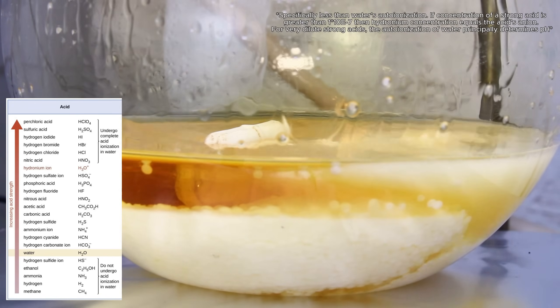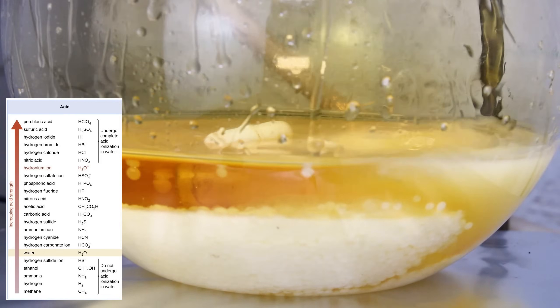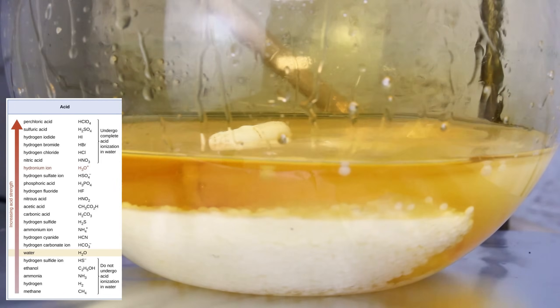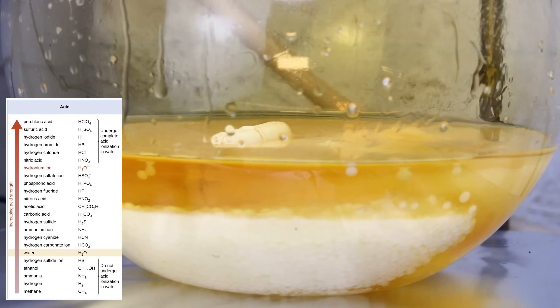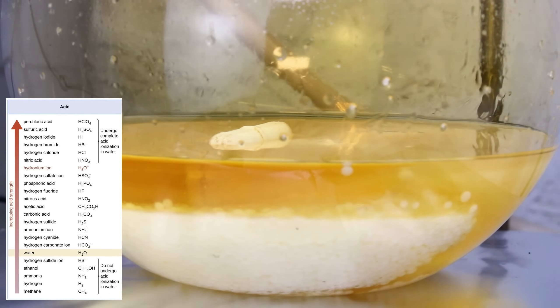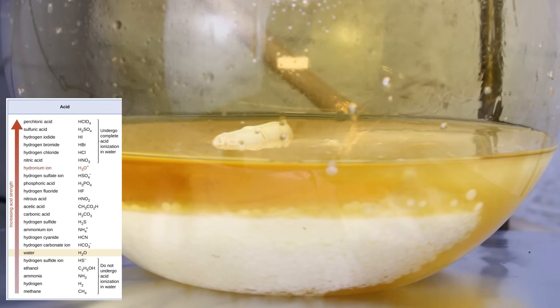However, not all strong acids are equally strong. Sulfuric acid is stronger than nitric acid, and so it will readily give up hydrogen to nitrate forming nitric acid under relatively mild conditions.